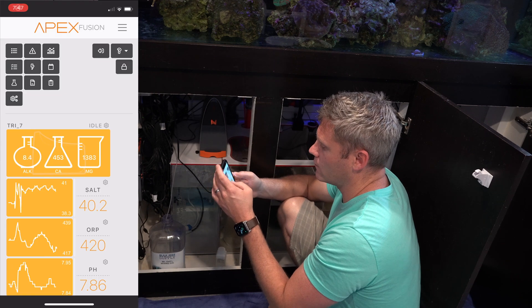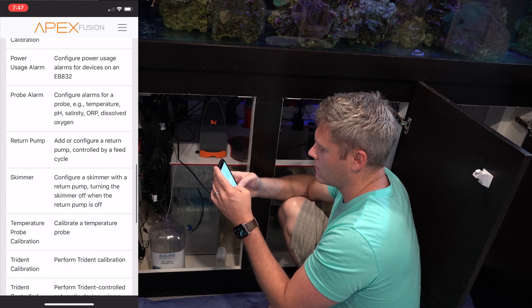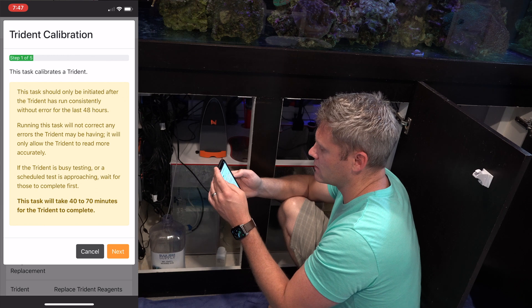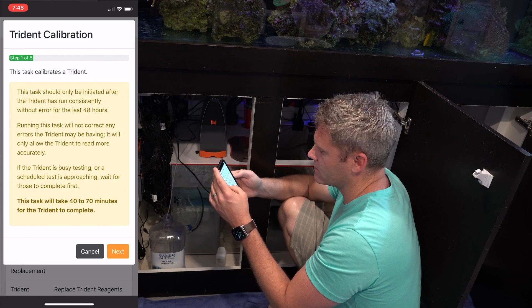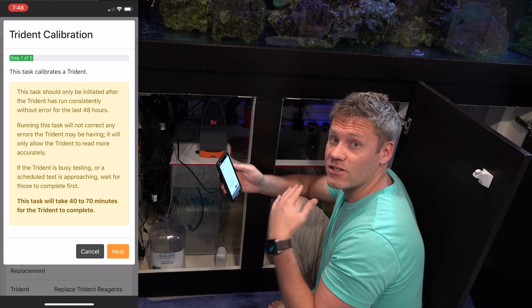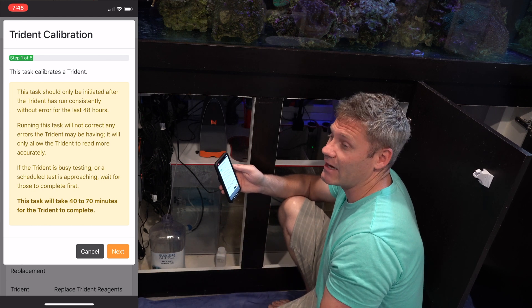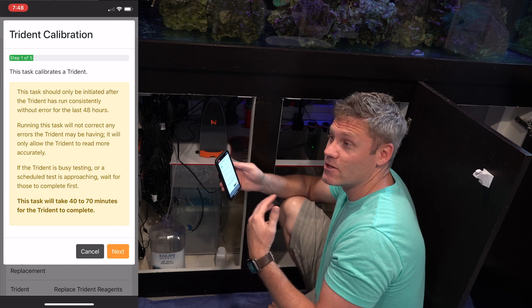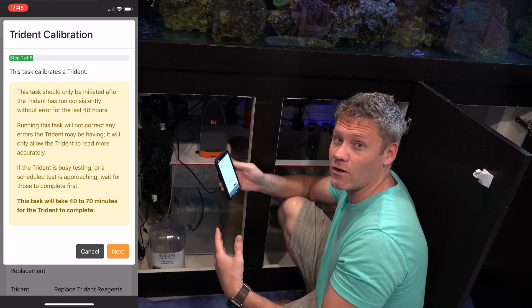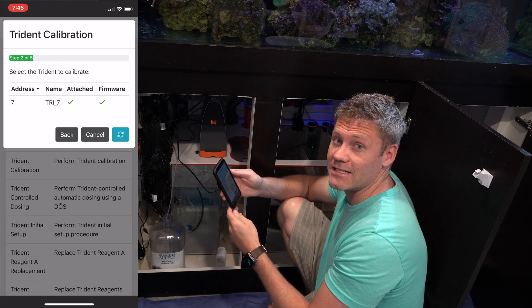Go to your Apex and go to your tasks, then Trident calibration. It's going to give you a warning — make sure you've waited at least 48 hours. When you go to calibrate, make sure you don't have a test coming up for the next two hours at least, since it takes 40 to 70 minutes to complete and a test can interfere with the calibration. So if it's about to test at 1:00 and it's 12:30, wait till after that 1:00 test and then calibrate at 1:30, so it can calibrate and be ready for the next test.